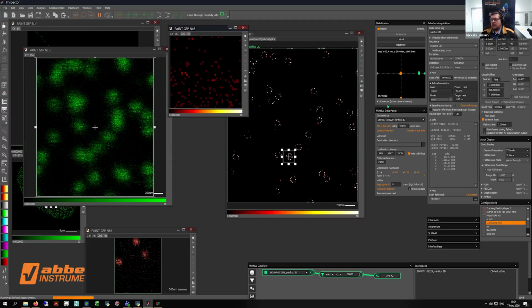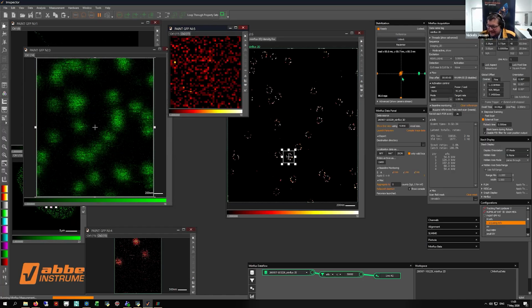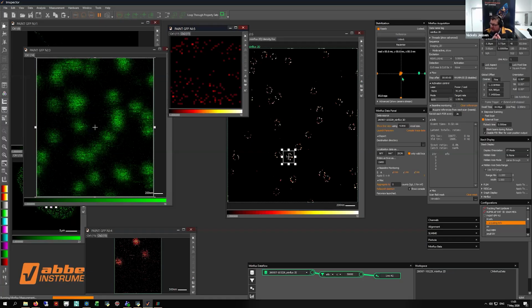One very important part: we want to get down to a resolution of 2 nanometers, or even below that. There are publications out there where we are in the angstrom resolution with our system, where you can see the difference between 3.1 and 2.5 nanometers in distances in molecules. But to measure that exactly, you need a very good stabilization. You have to make sure that your sample doesn't move in the time while you're imaging. Every movement, every small drift will be visible in your data.